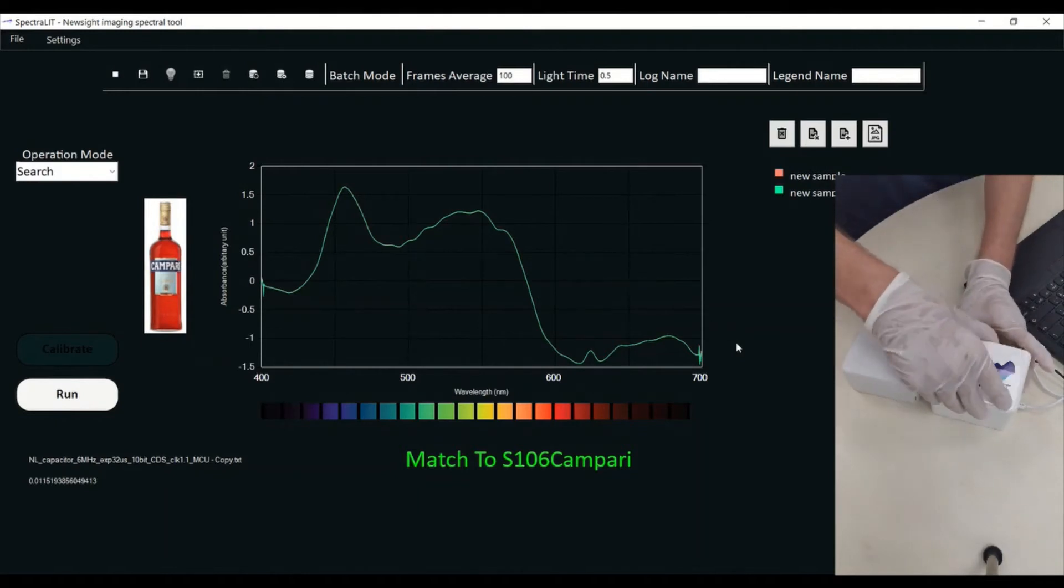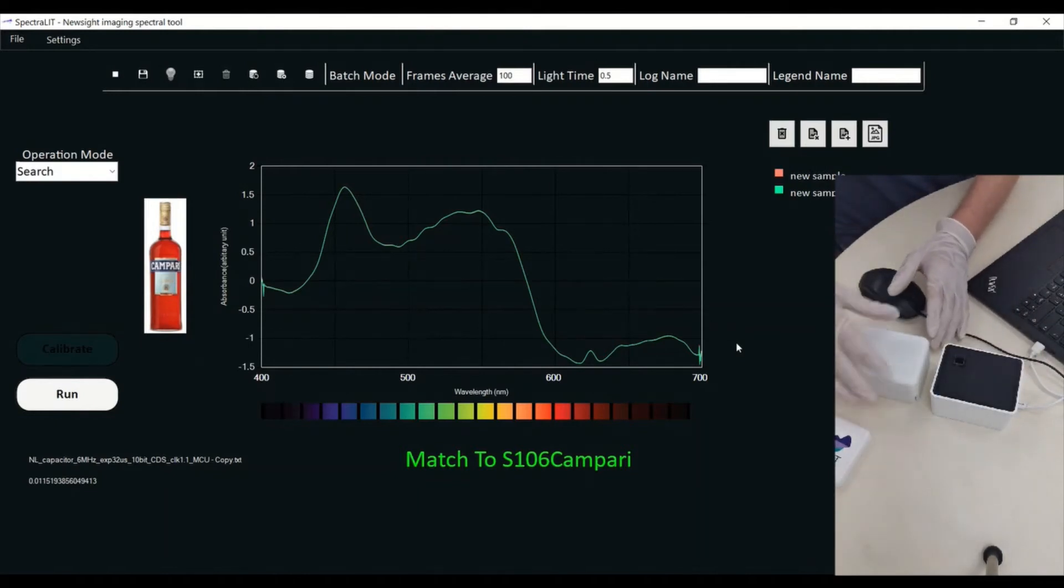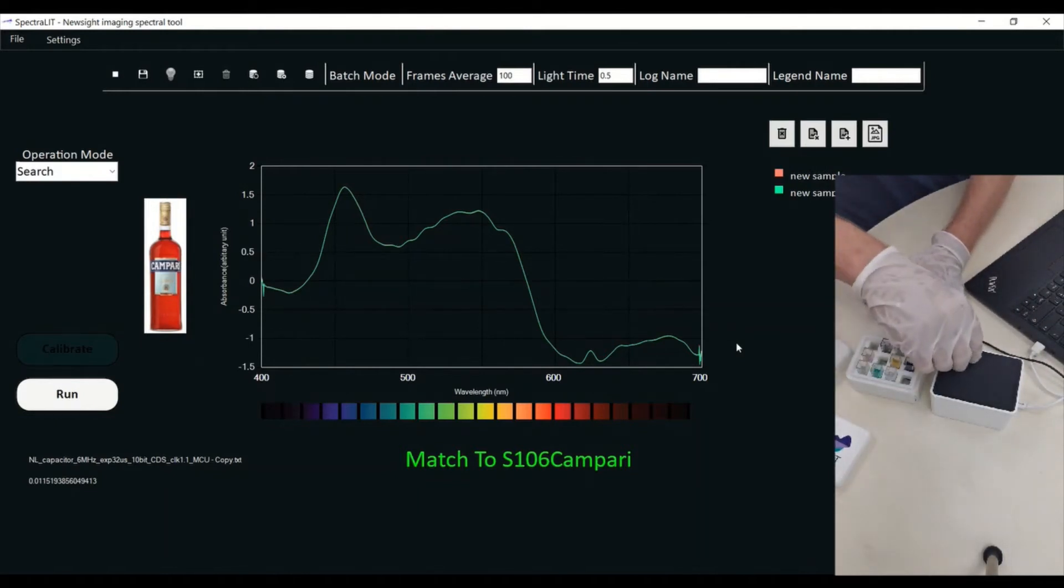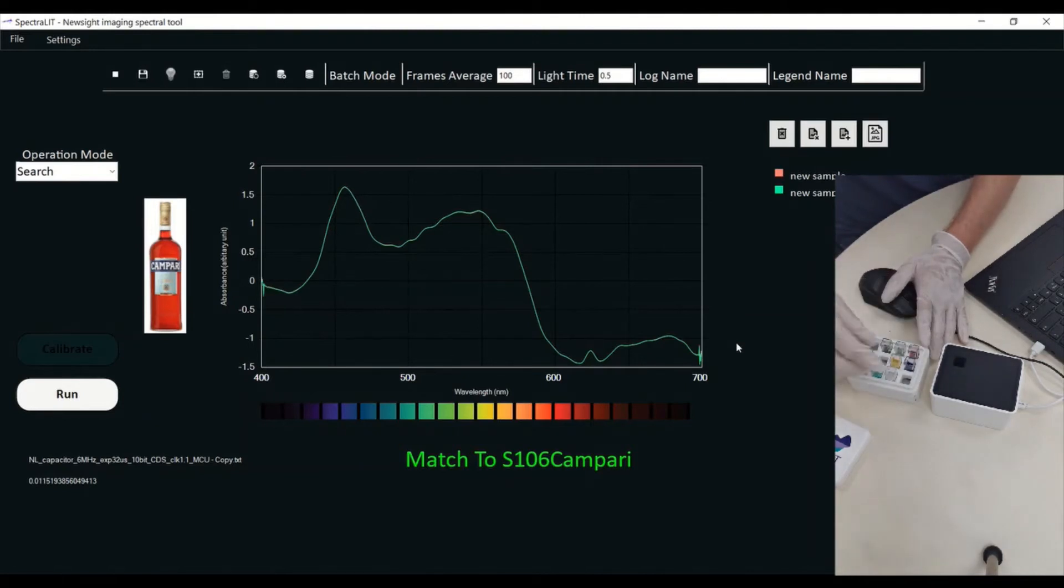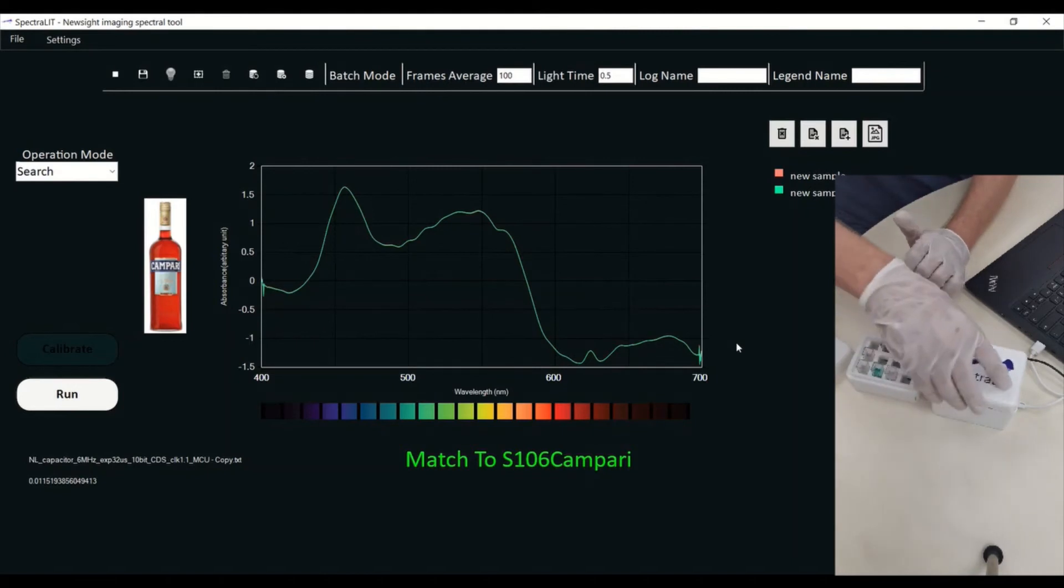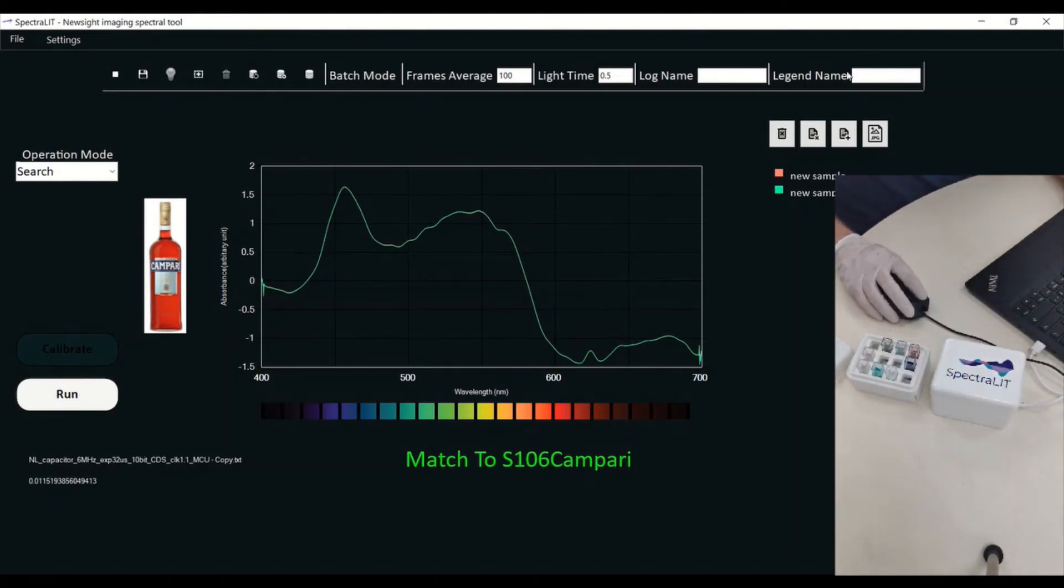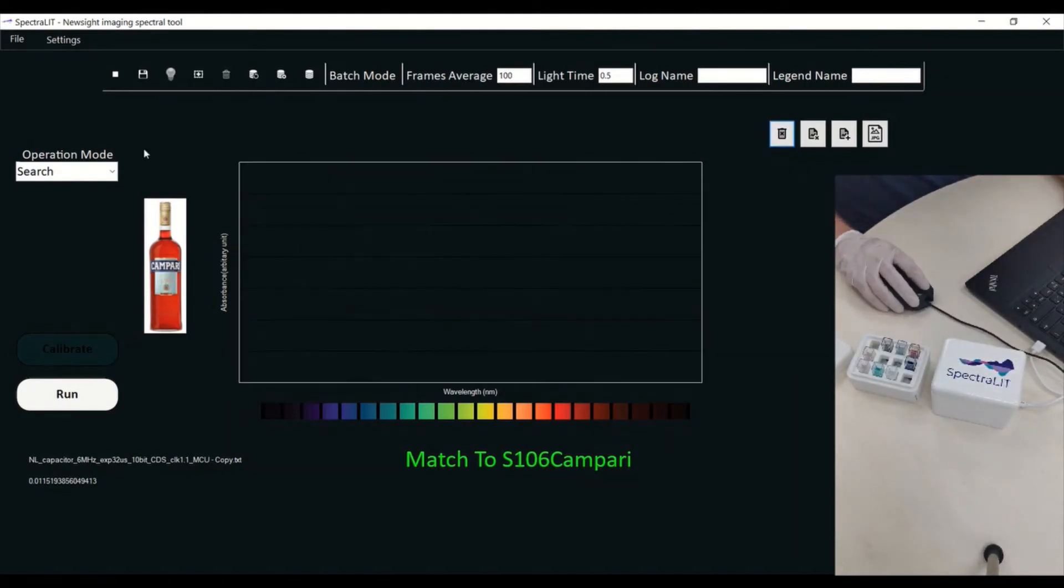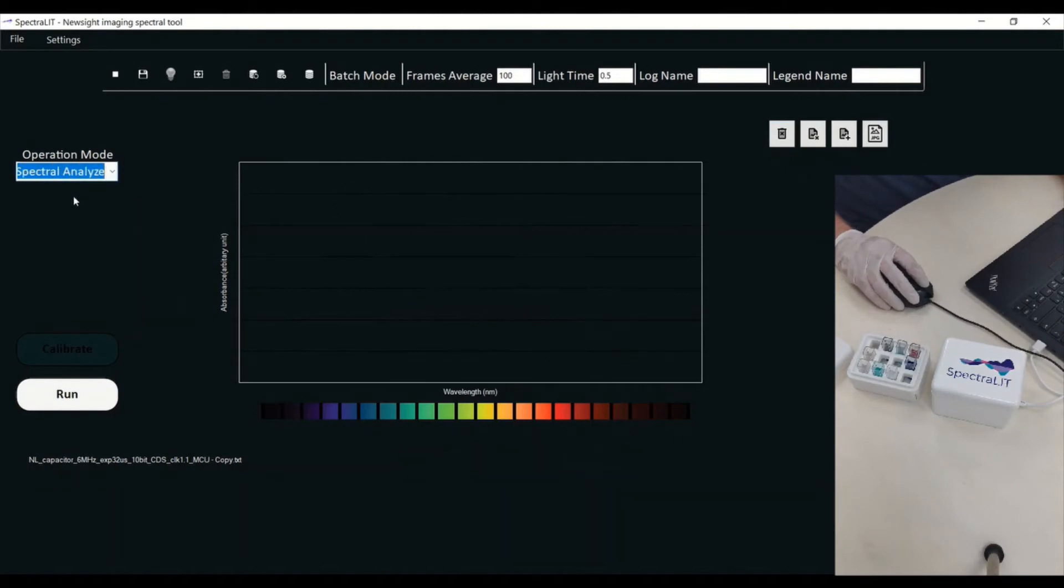I can, of course, replace the substance with a different one. Let's say I'm going to put this yellow drink which I don't really know what it is. I'm going to clear the screen and take a spectral signature just to see what I have inside.